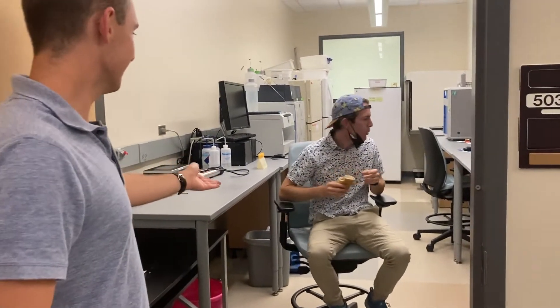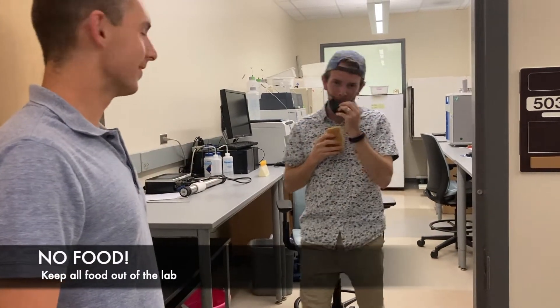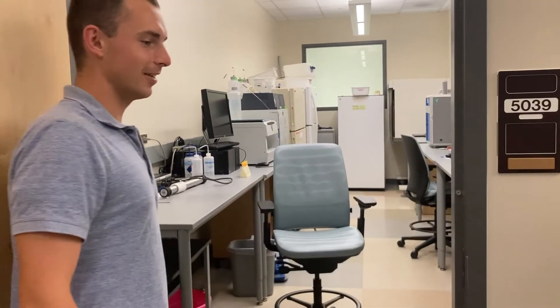Yo, Nick — do you not read the sign? Oh, this is a clean room. I forgot.